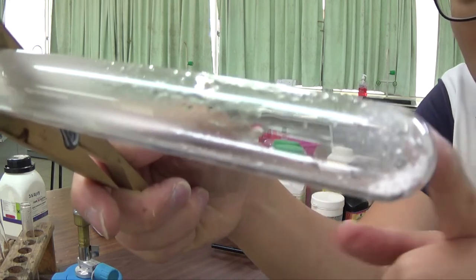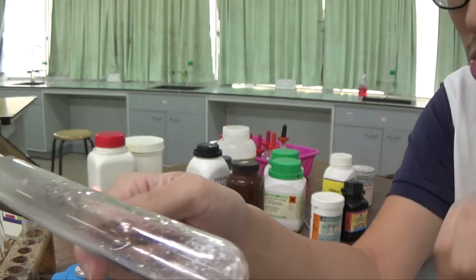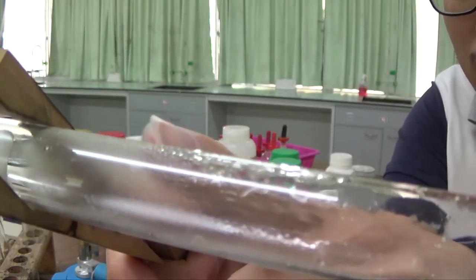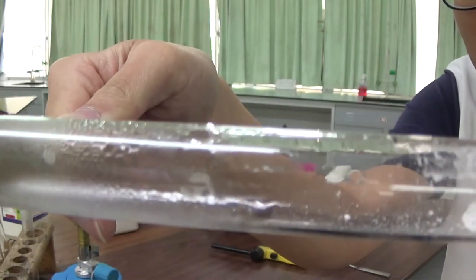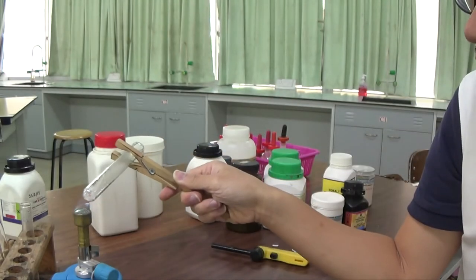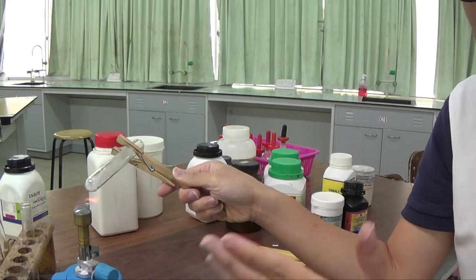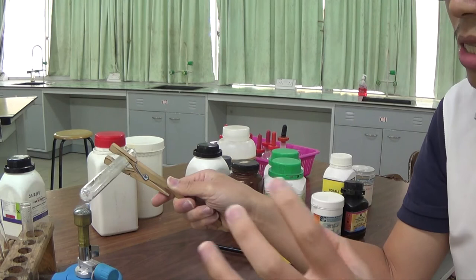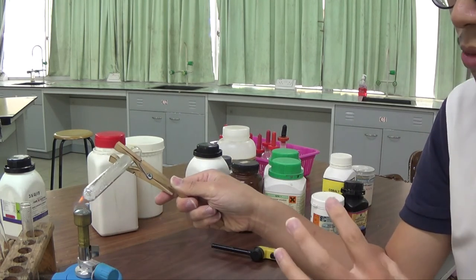So this one, you see the solid has started to produce that sound just now, right? Because it was heating very strongly. And now I've got a colorless liquid, I've got condensation on the upper part of the tube. If I heat it further, then the liquid will travel further up because the upper part of the tube is cold, and the water vapor, the steam, that escaped from the water of crystallization will escape as water vapor or steam.